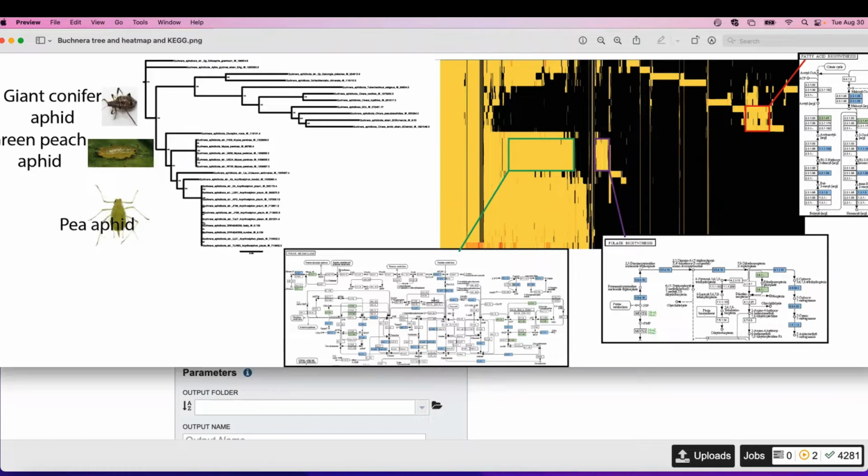So that's what we're going to do next, is to look at not only the protein families, but the pathways. And I'm going to show you tricks, or ways you can use the resource, to find out what's unique about your data. Because this is what everybody wants, right? You've been working in the lab. You found these things. You think they're probably interesting because of some experiments you've done in the lab. You sequence them, you assemble them and annotate them.